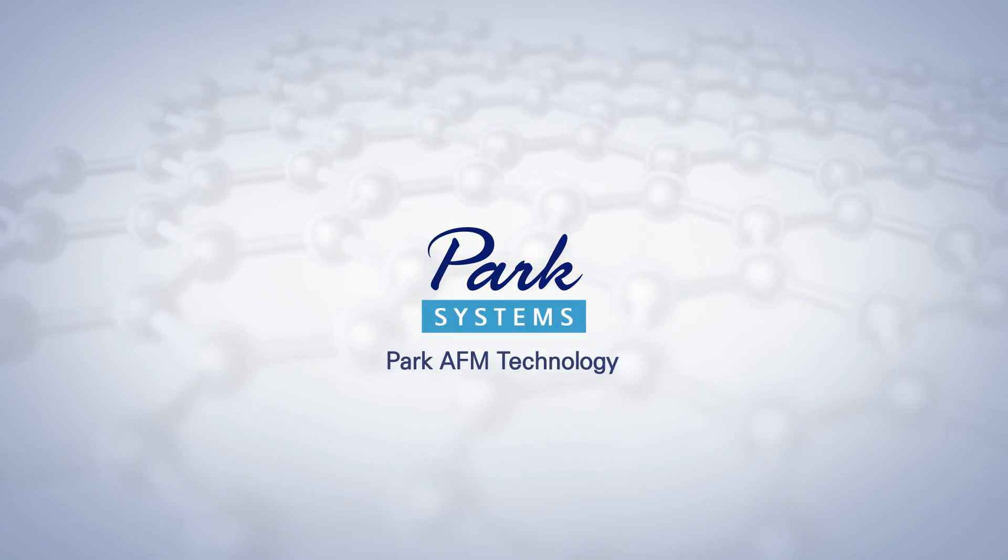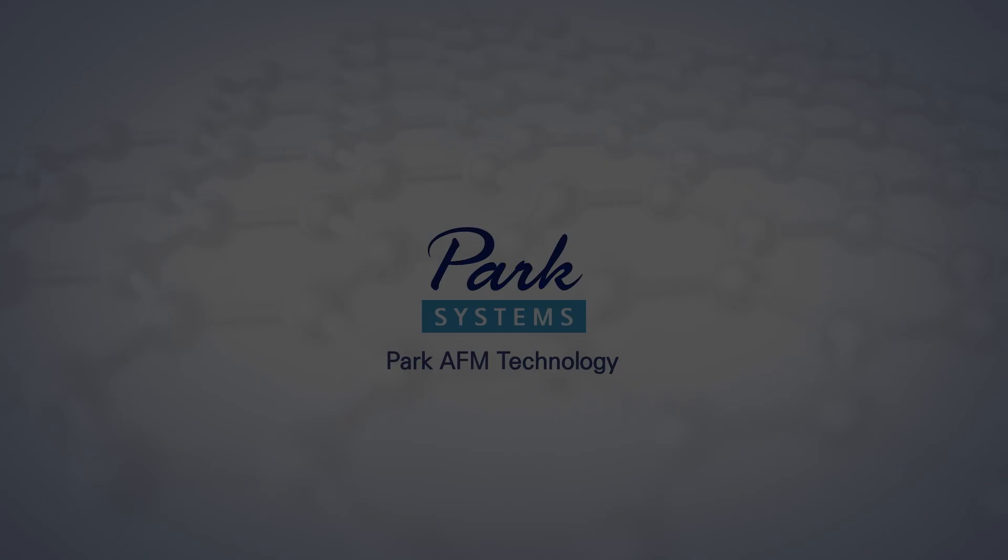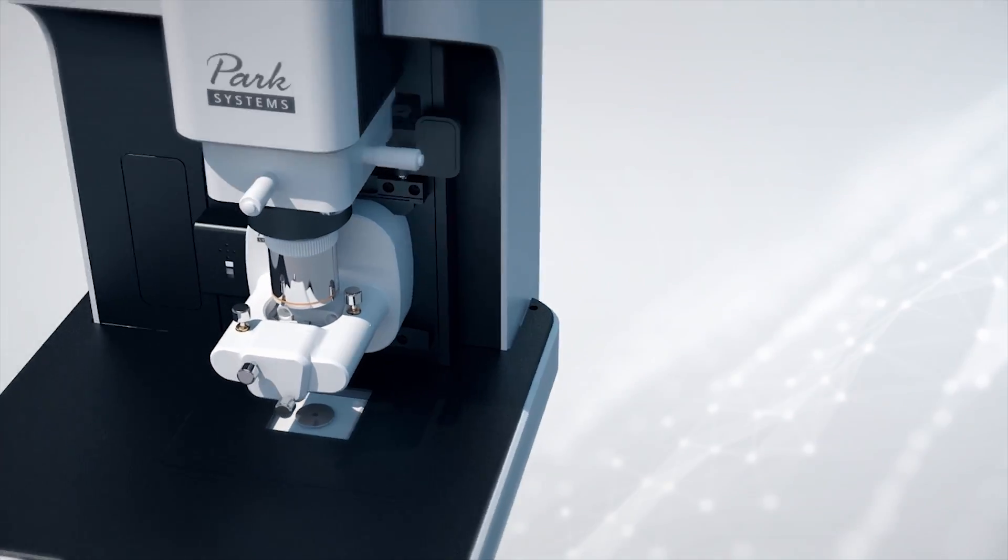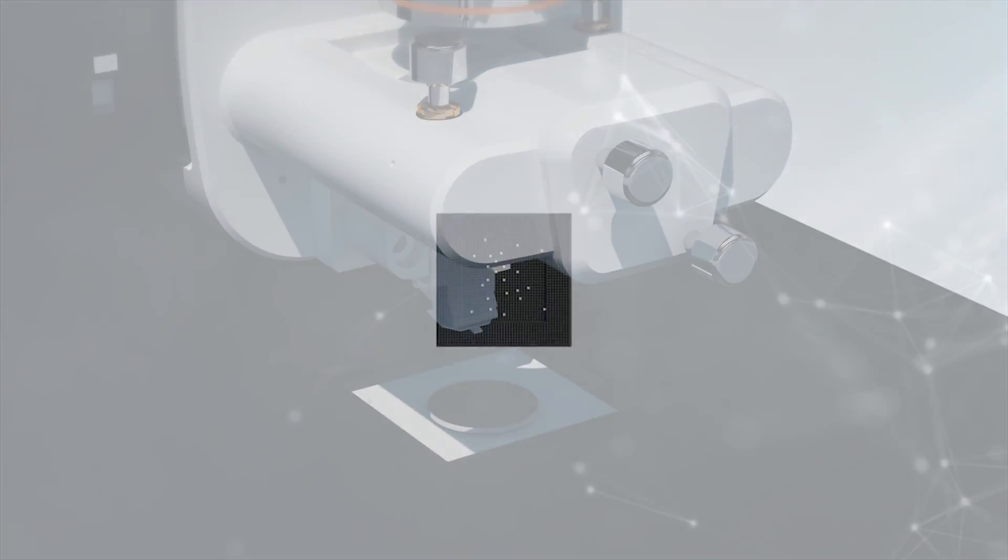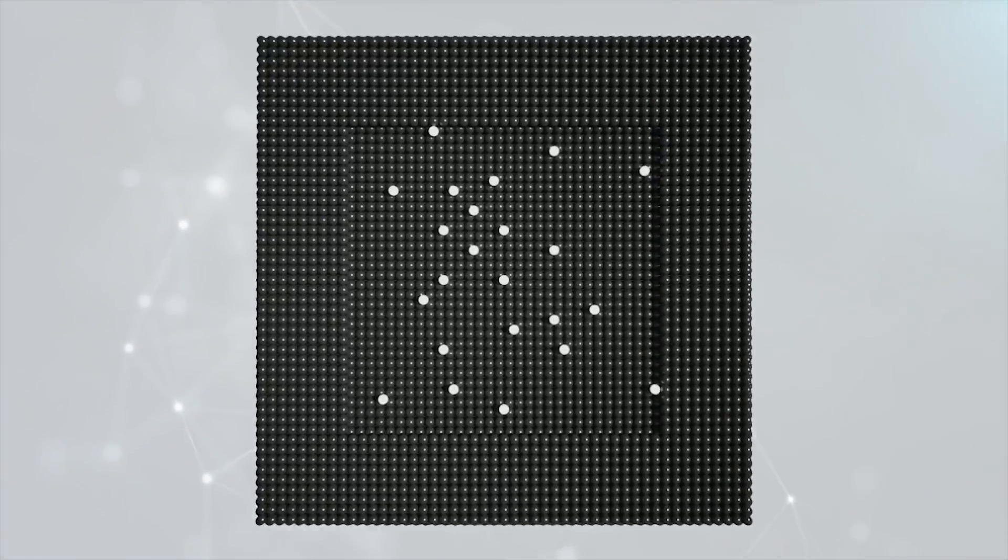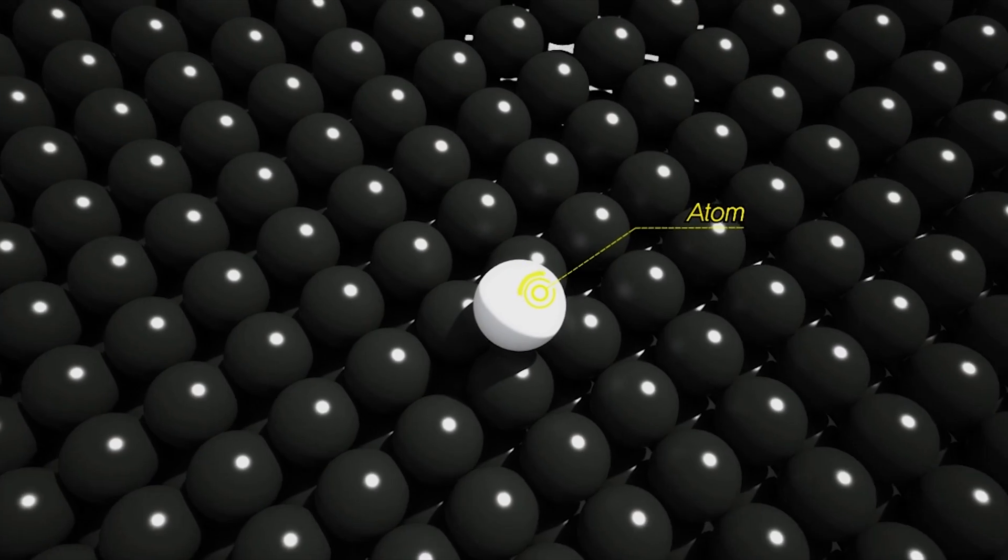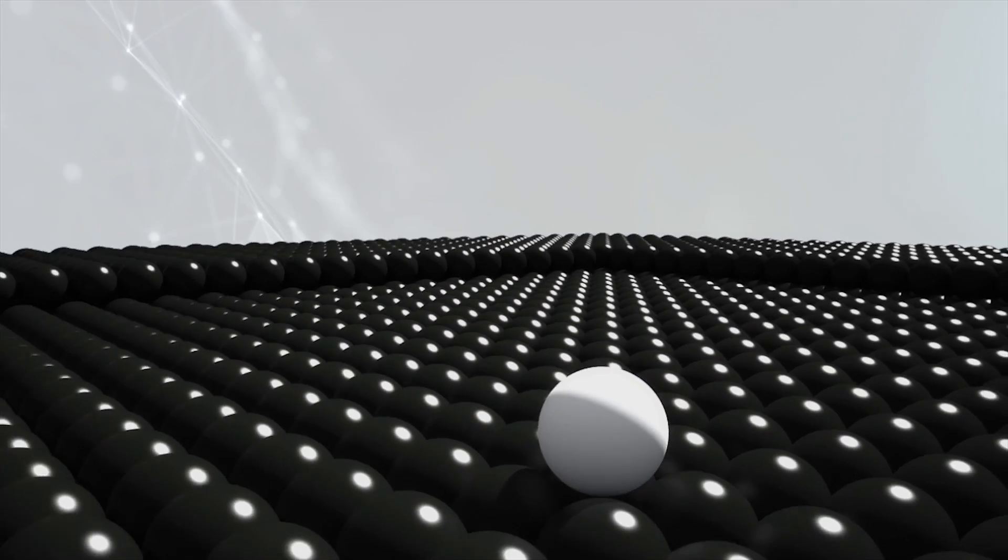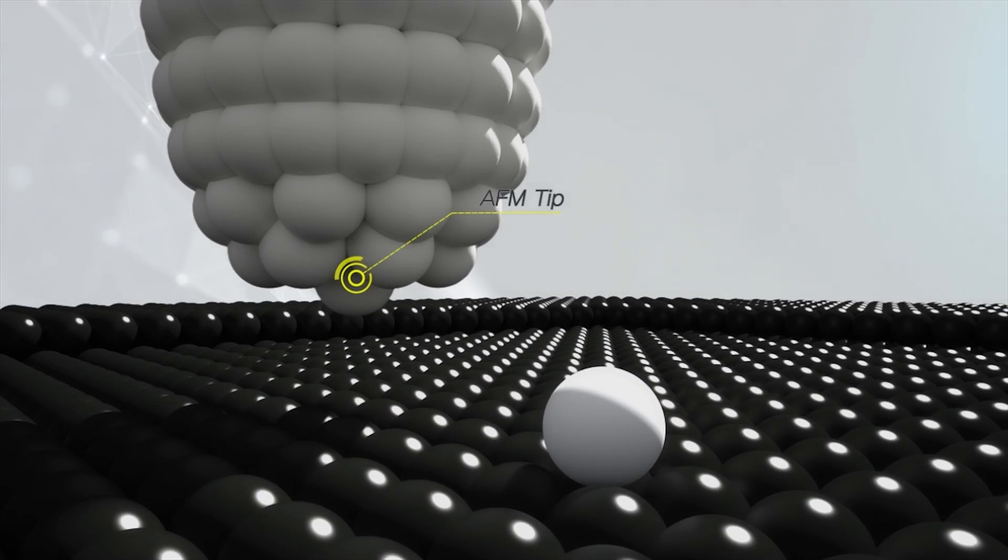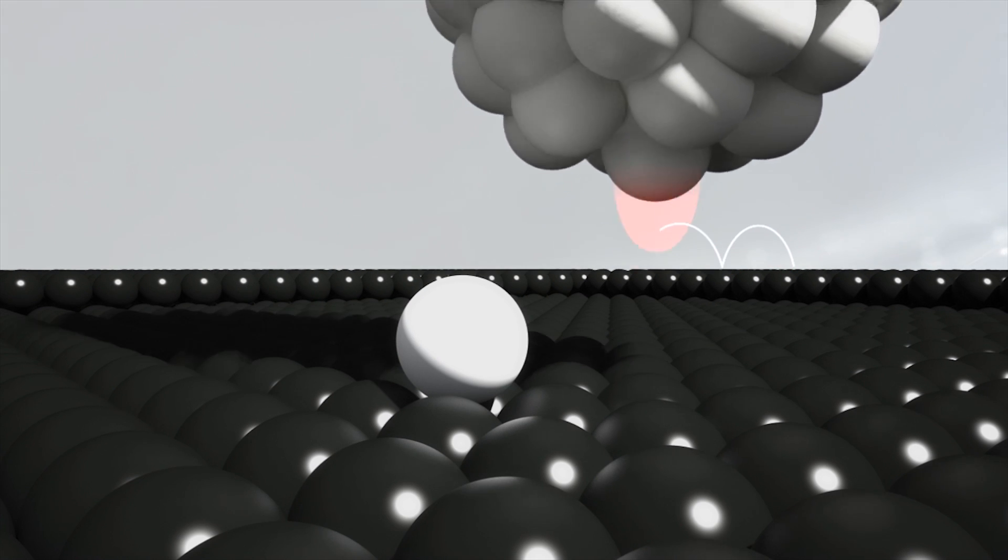Park AFM Technology. An atomic force microscope is a device which measures the form and various physical properties of a sample by bringing the tip of a probe to the sample surface and measuring the interaction forces between the atoms of the tip and those of the sample.